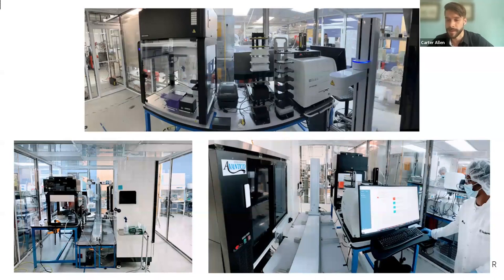All right, and we have another question, which is, have you noticed contamination with the Opentrons HEPA module? In the customers that have used that, sterility has not been an issue up until this point. It has done a pretty good job of keeping the environment sterile, especially making sure that you're only moving the lids and unlidding them for short periods of time under that HEPA filter space.